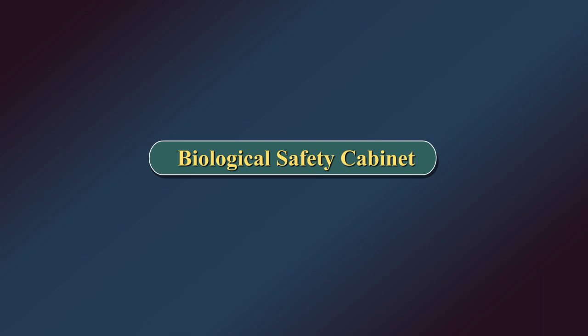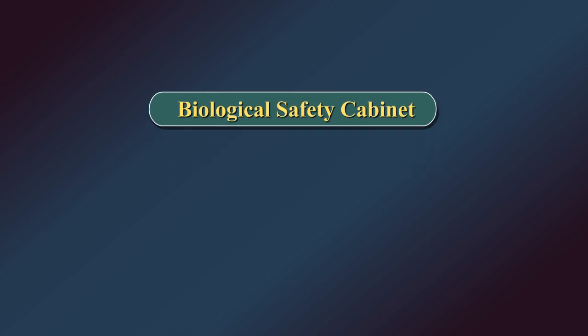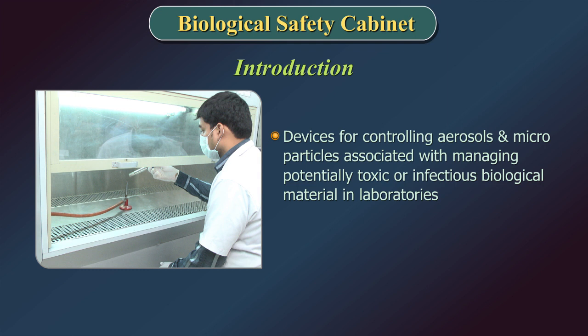Biological Safety Cabinets are devices for controlling aerosols and microparticles associated with managing potentially toxic or infectious biological material in laboratories.